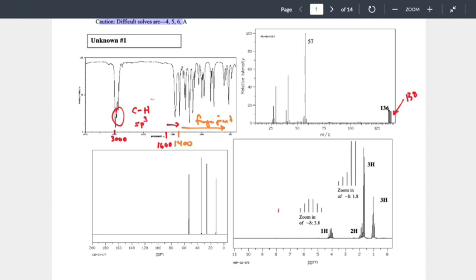The last thing that we can look for is iodine. And in this case, there's going to be no iodine. How do we know there's no iodine here? It's actually a bit borderline. What's the mass for iodine? Yeah, the molar mass for iodine is 127. We're at 136, so could iodine be there? Yeah, 136 is greater than 127, but that doesn't leave a lot of room to put any other elements.